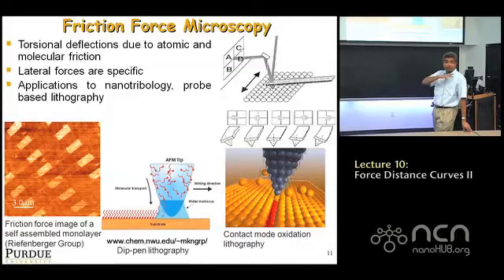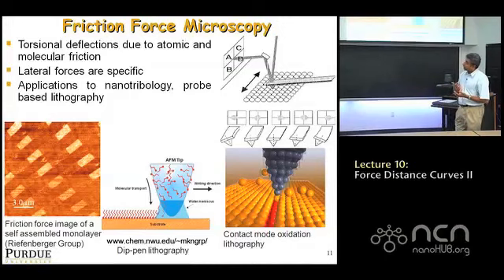So you do contact mode imaging, you might just squeeze these molecules so that you don't see much of a topography image, but when you monitor the friction channel, you see it a lot, because not surprisingly, the lateral forces depend on the chemistry and the molecular structure of what you're scanning over, right? And of course, contact mode has other interesting things you can do with it.